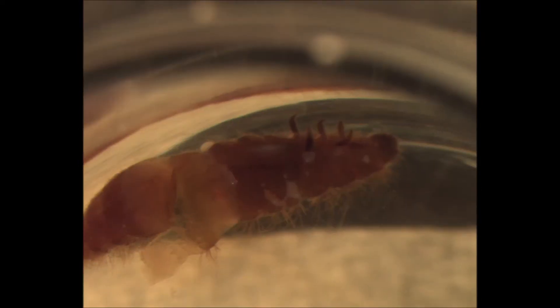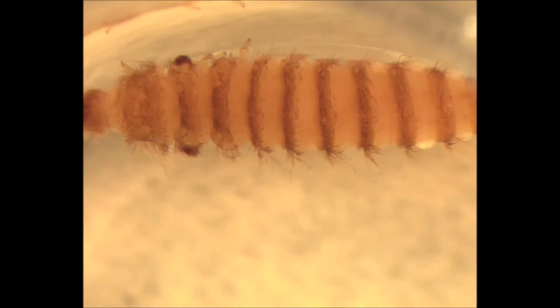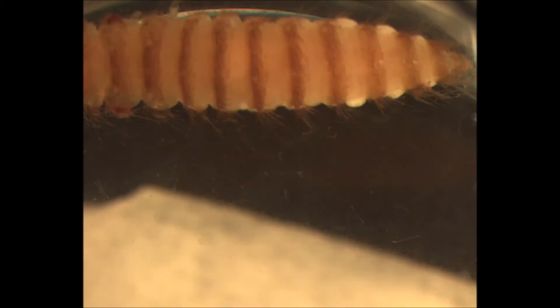We'll take a look at the specimens being cleared. These have been sitting overnight in KOH. Some of them are at various degrees of suitability for dissection. This one is okay, this one is still not very clear. You can see if I take away the kimwipe from underneath, the specimen is still pretty opaque. Here's an exuvium; it's very clear, but we'll try to work with an actual specimen if we can.